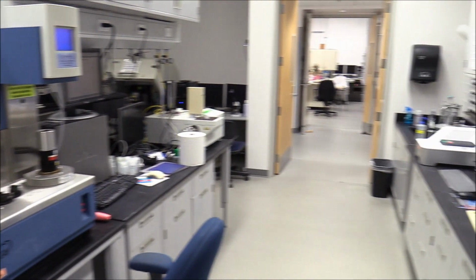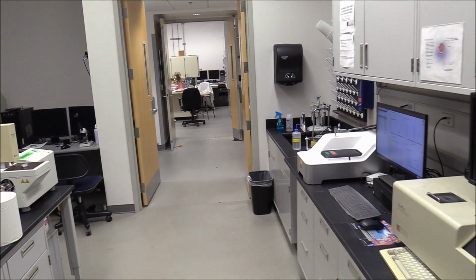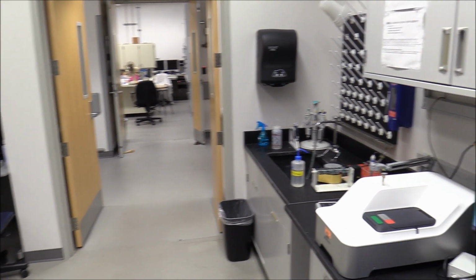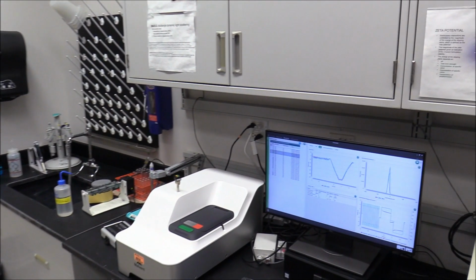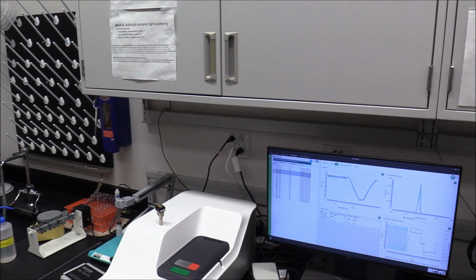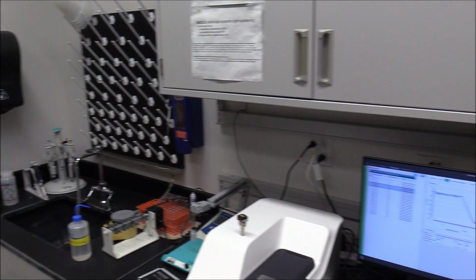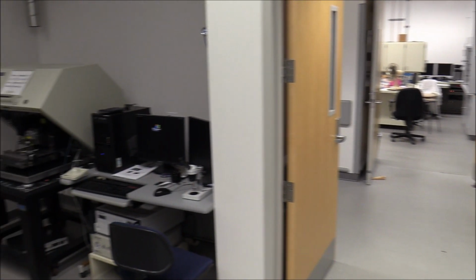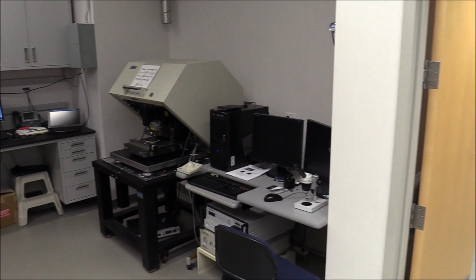Moving back to the right side of the room, you'll see a Zetasizer. This instrument allows for the measurement of particle and molecular size with the ability to analyze particle concentration of monodispersed samples below 500 nanometers. The Atomic Force Microscope, or AFM, is a high-resolution nanometer scale type of scanning probe microscope.